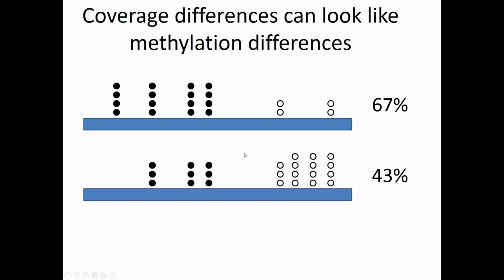So how do we cope with this? Well, there are a few different ways. The easiest way is to say that when we're comparing samples, we only take bases for quantitation which were observed in both of the samples. So now we'd only take the ones with the red bars on them. We're comparing like with like, and now we would see effectively no difference between the two samples. This works really well if you only have a couple of samples, but if you have a large number of samples, it doesn't scale. Different bases will be randomly dropped from different samples, and if you had like 20 samples, you would lose a very large portion of your genome from doing this.